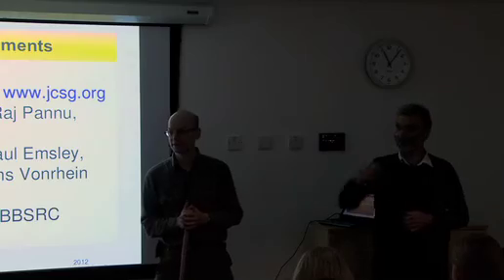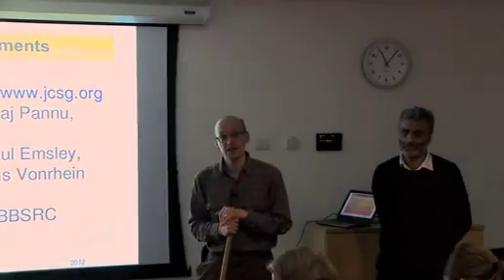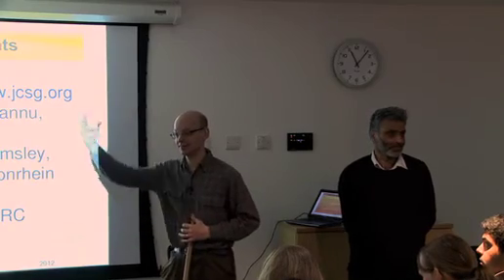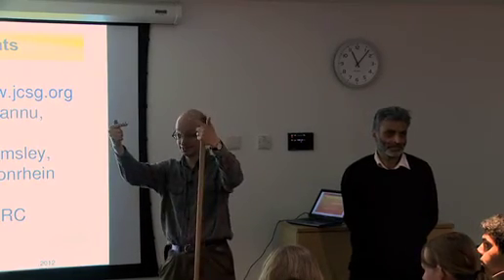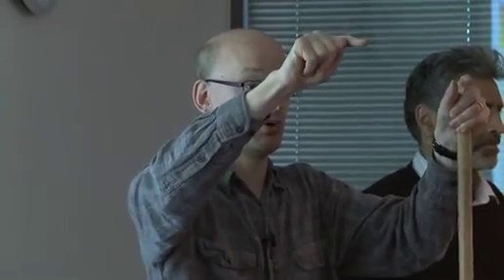How to do it. So will Buccaneer try to build, if there's locally no density for one or two residues? So it will build across, if it has an N and a C terminus with sequence numbers, because both ends have been sequenced, which support a short link, then it will automatically build that link if there is a plausible way of doing so.